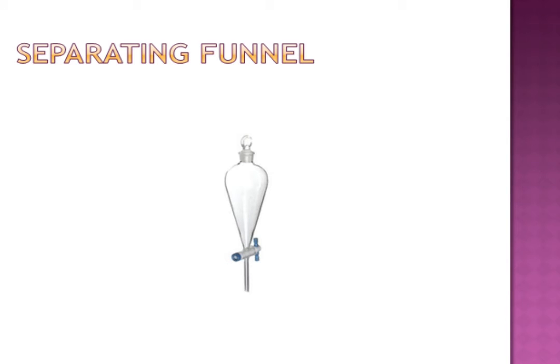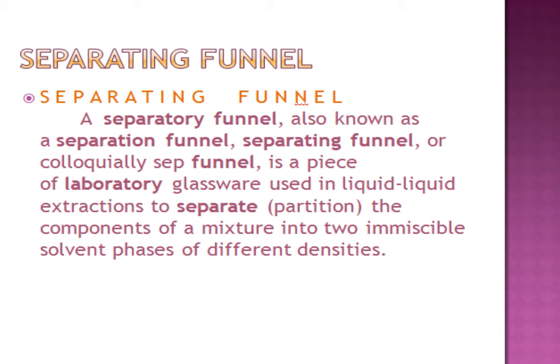Next up is a separating funnel, and this is how it looks. Let's learn the spelling of a separating funnel. S-E-P-A-R-A-T-I-N-G. Separating. F-U-N-N-E-L. Funnel.